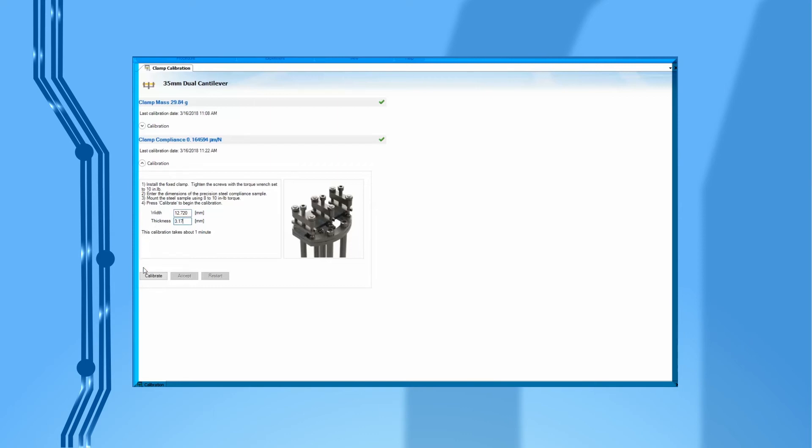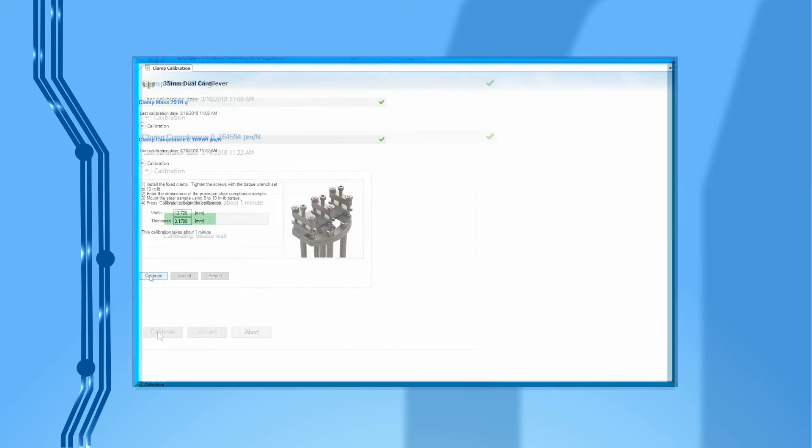If the calibration is finished normally, the compliance value should typically be lower than 0.2 micrometer newton. Click on accept to finish the calibration.